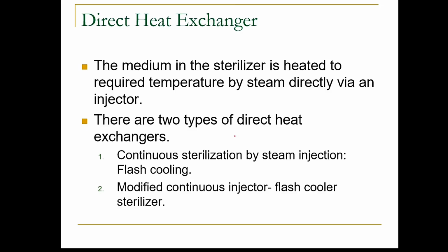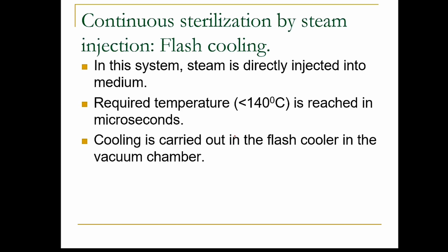Direct heat exchanger. The medium in the sterilizer is heated to the required temperature by steam directly via an injector. There are two types of direct heat exchanger. Continuous sterilization by steam injection with flash cooling, and modified continuous injector flash cooler sterilization.